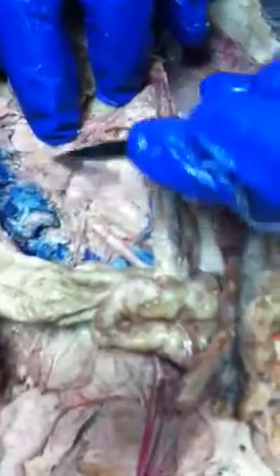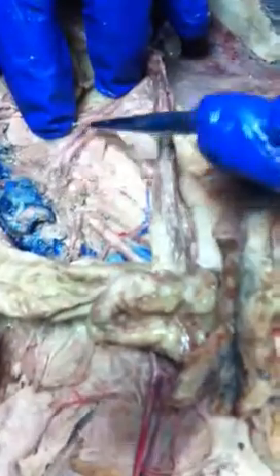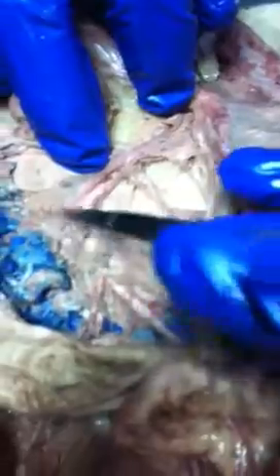We will also have gonadal arteries, and there is your gonadal. It is tiny. They are tiny. But see how it's going all the way to the ovary? You can really see it. It's one of the bigger ones I've actually seen. Gonadal artery.